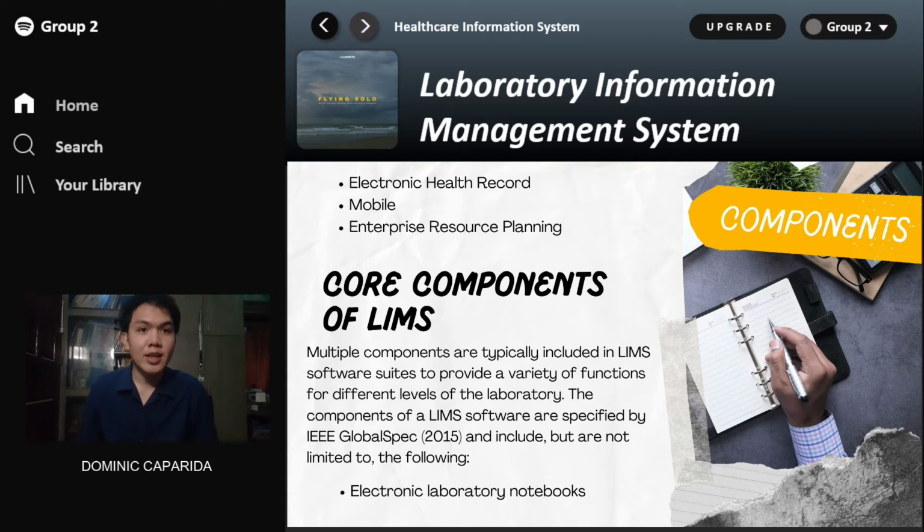They keep these electronic laboratory notebooks in the laboratory, or they can use and bring it outside where they list everything from the staff to the machines and to the schedules. They list everything in this notebook, where it has a lot more advantage in the credibility and reliability of the ELN, or the electronic laboratory notebook, than in the paper laboratory notebook.